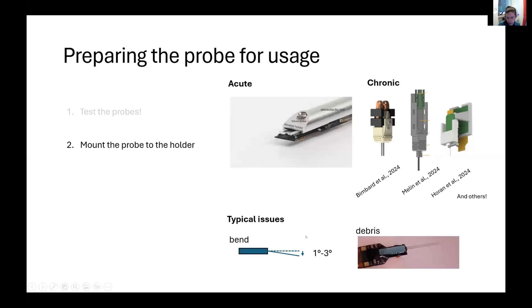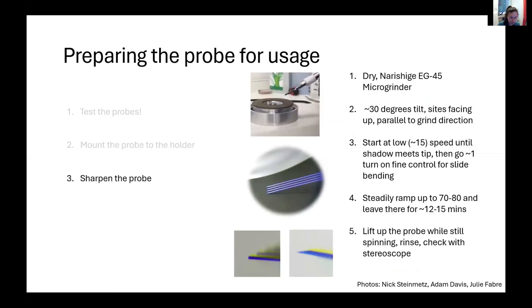Two typical issues you might have: the base can slightly be bending compared to the shank, which you can correct using glues or something like that, and that is normally corrected by eye. Sometimes you also see a bit of debris on your probe, which you can just scrape away. Another important step is to sharpen your probe. At the bottom you see an unsharpened probe compared to a sharpened probe. This is not done by IMEC, but normally users can sharpen the probe themselves.